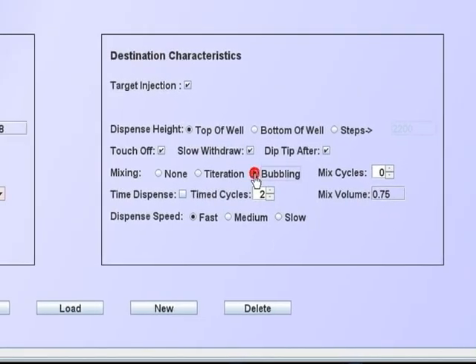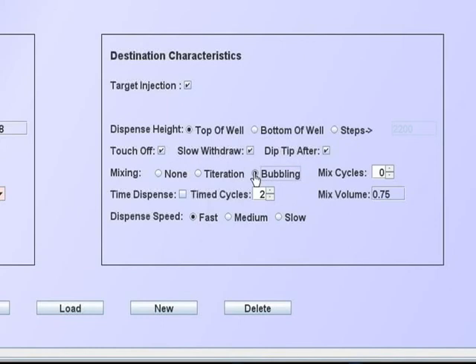Bubbling is a very effective mix action. Four hundred and fifty microliters of air is aspirated and then dispensed at the bottom of the well. Bubbling cannot be used if foam would be created by the contents of the well.